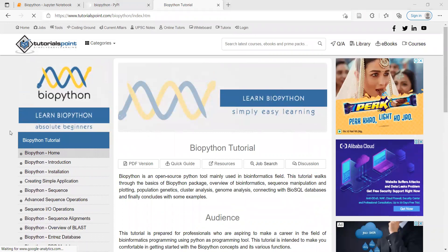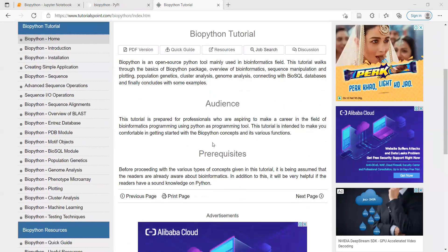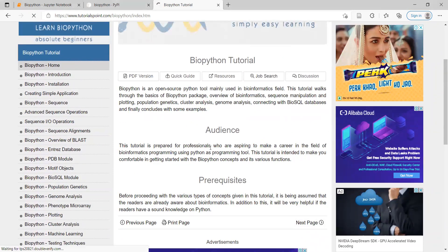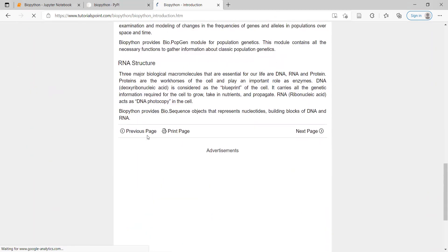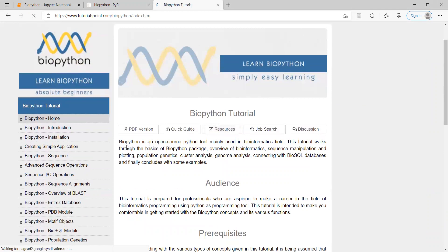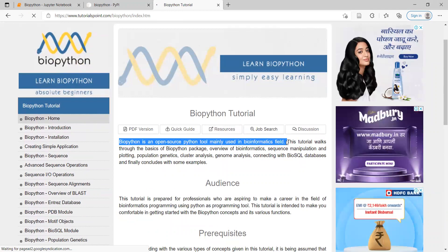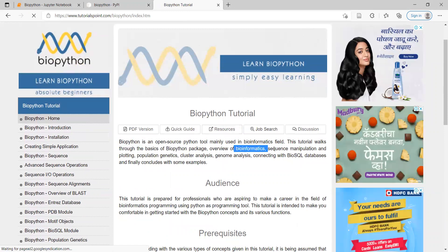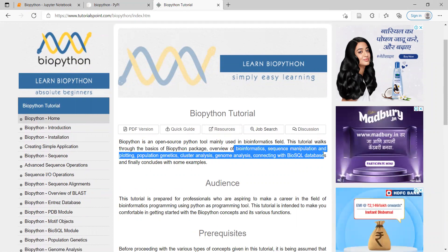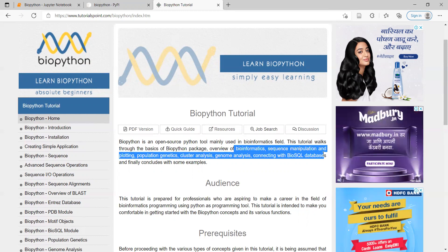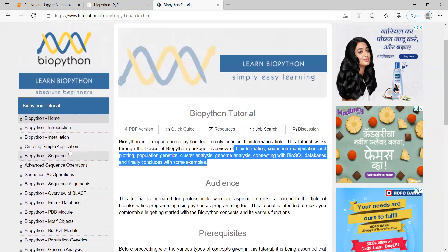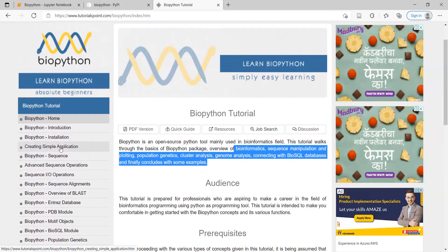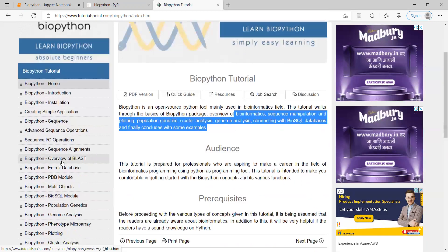I have clicked on the home page, and once you click on the home page you will see the BioPython tutorials available there. Click on the next page. Before going into the tutorials, we need to know what BioPython is. BioPython is an open source tool mainly used in the bioinformatics field. This tutorial walks through the basics of BioPython: packages overview, bioinformatics sequence manipulation, plotting of data, population genetics, clustering analysis, and genome analysis.